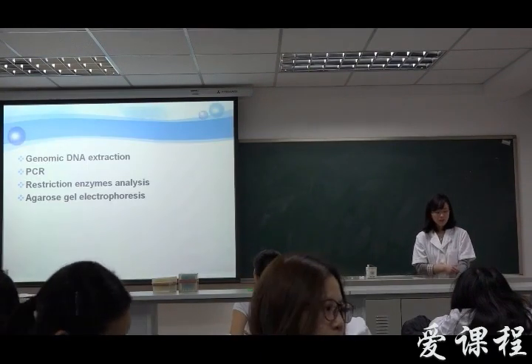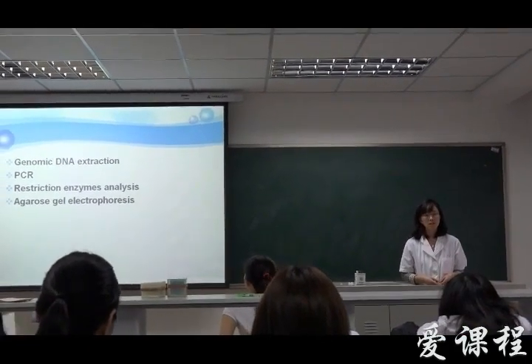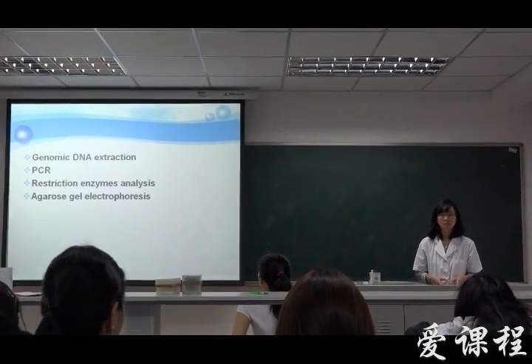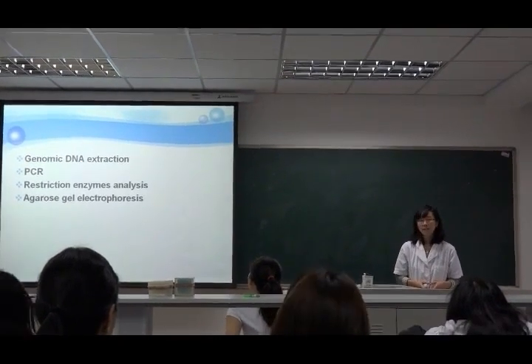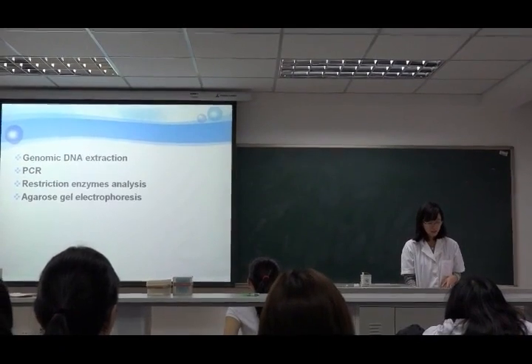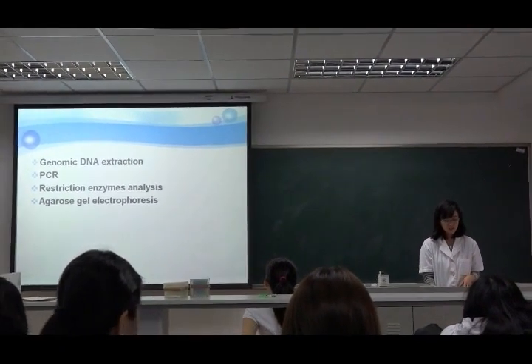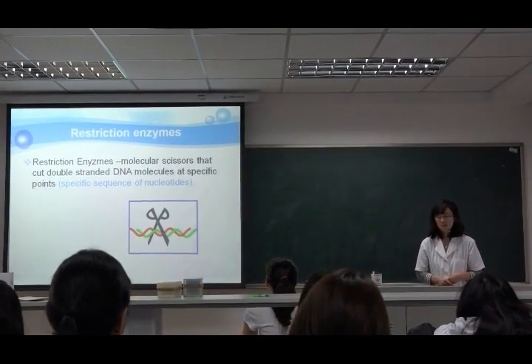Last week, we extracted the genomic DNA from the cultured cells, and then we used the extracted genomic DNA to do the PCR. Today, we will use the PCR products and we will do the restriction enzyme analysis. First, I will introduce the restriction enzymes.